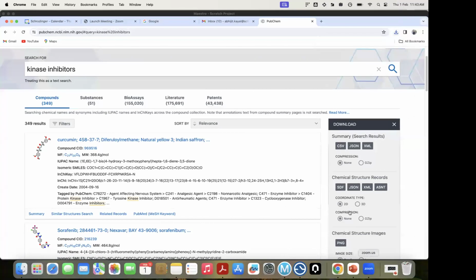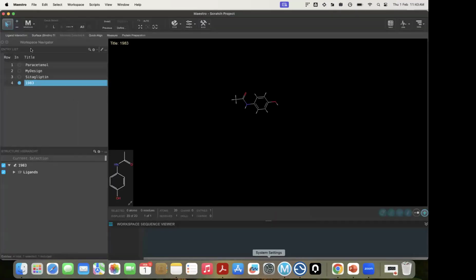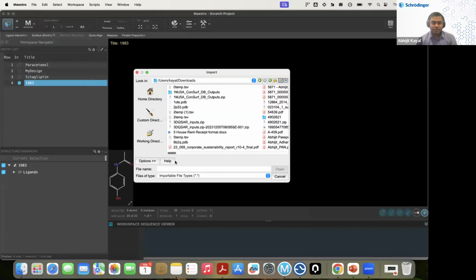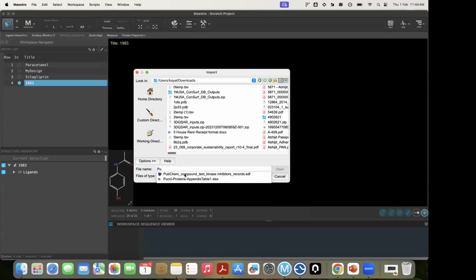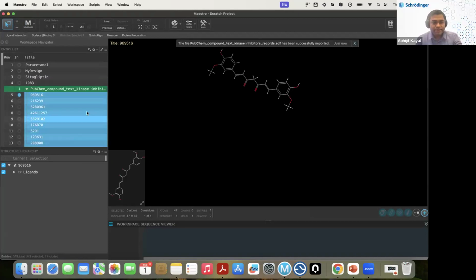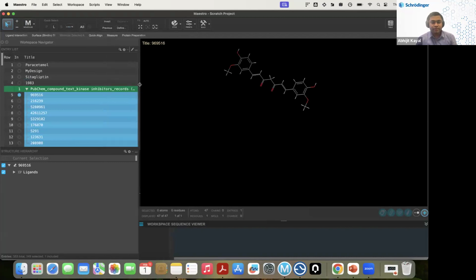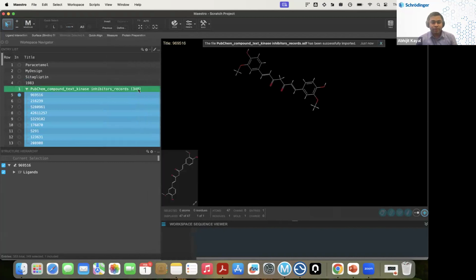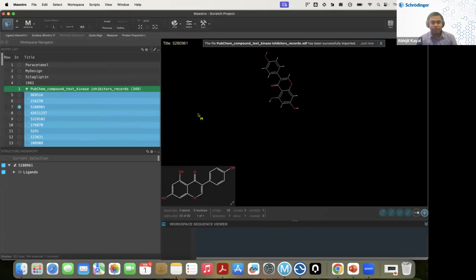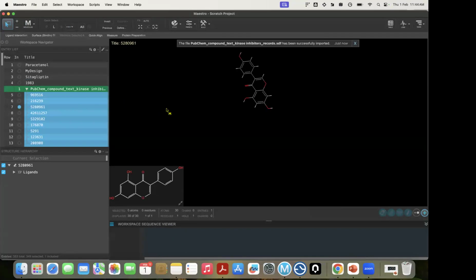I will go back and import structure there. I will go to Import Structure, and I'm already in Downloads. It is the PubChem compounds, kinase inhibitor file, and you can open it. So all these 349 will be incorporated in your Maestro. Okay, sir. Understood. Thank you.